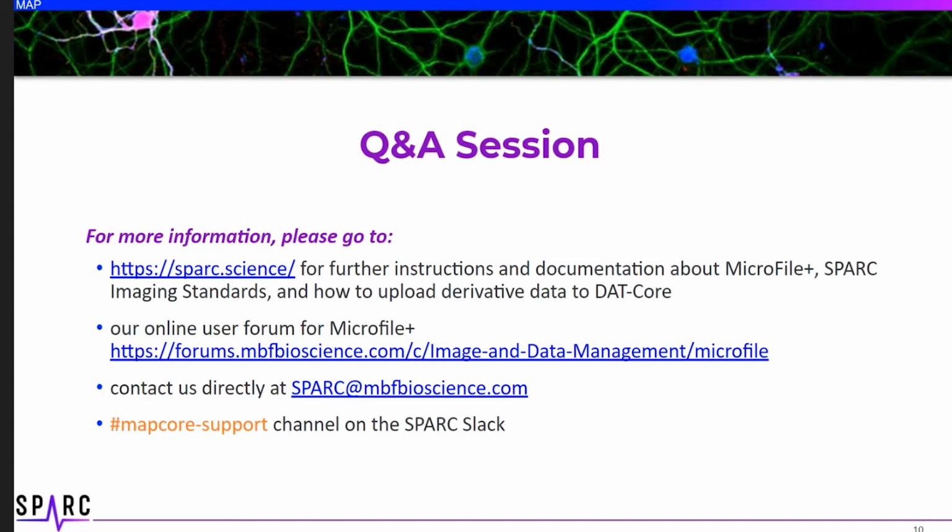Besides ImageJ, which other kinds of software can open the OME TIFF and JPEG 2000 formats? Photoshop, I know, is one that people use. Any additional, Sue or Nate, that you can think of?